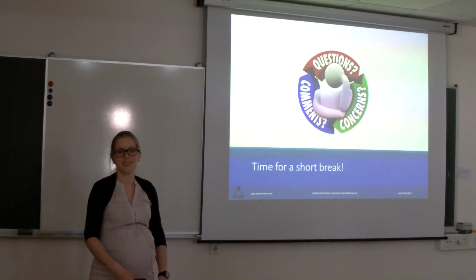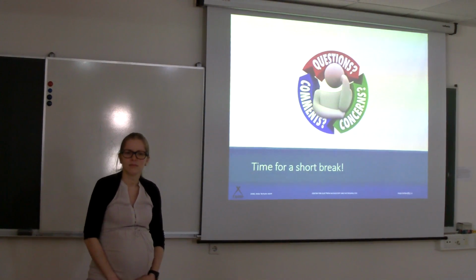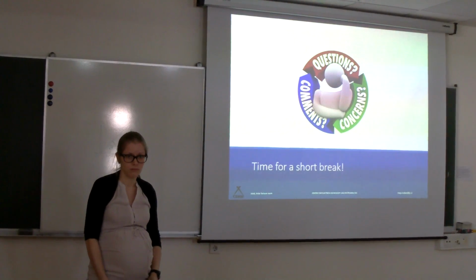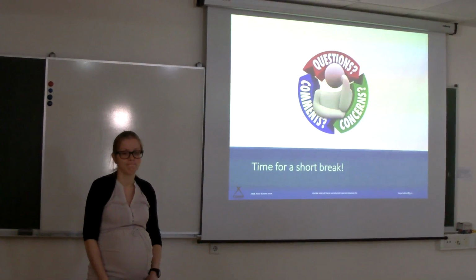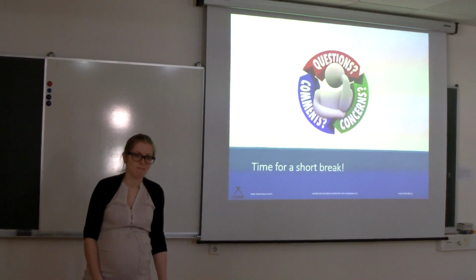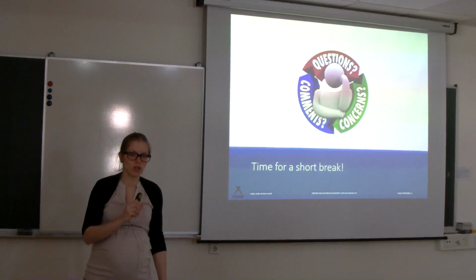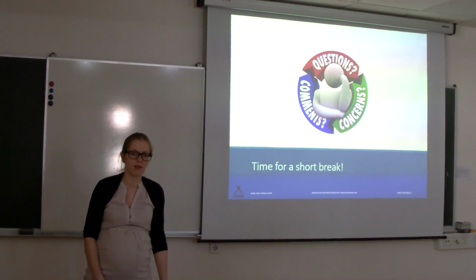Yes. As I understand, if we have powder and are doing EDS on the powder, we cannot get the correct quantification. Or am I wrong? But what's the error? Like 5% or something? Because for me, it's really important if I have 25 or 20% of some element inside. Yeah. So in the next workshop, we will talk about how to determine the error.